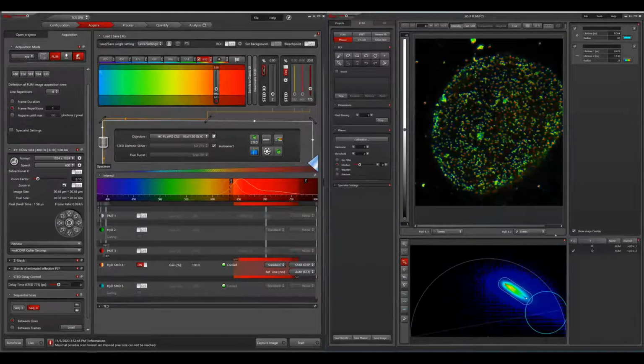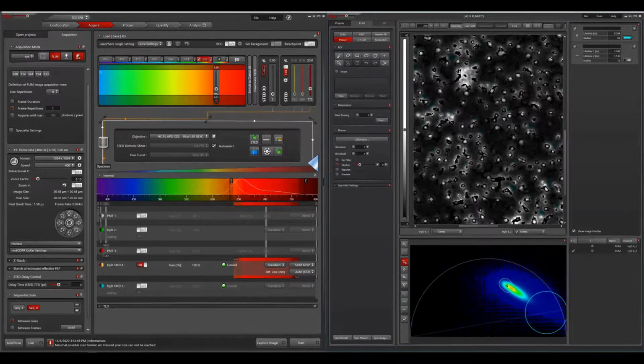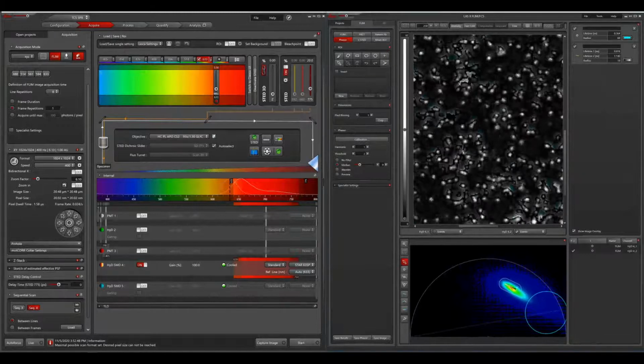Now with the Tau strength slider, I can illustrate what is happening if I change the color here now. The Tau strength slider is simply a threshold that is changing this gradient here. So by only displaying the high resolution photons, when I increase my Tau strength slider, I can improve my resolution even further, as you can see. If I keep all the photons, however, when I reduce the Tau strength slider, resolution goes down, but I am not removing as many photons anymore.